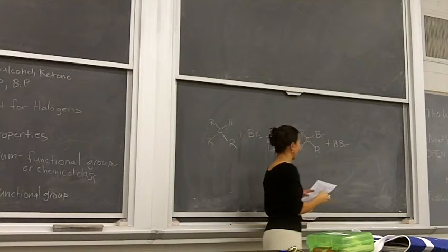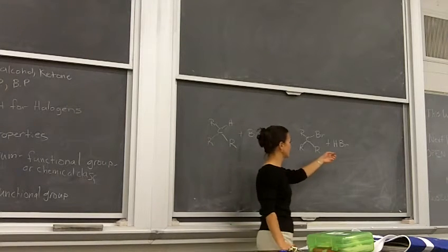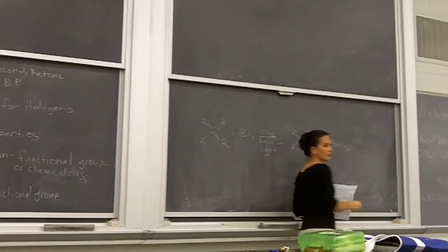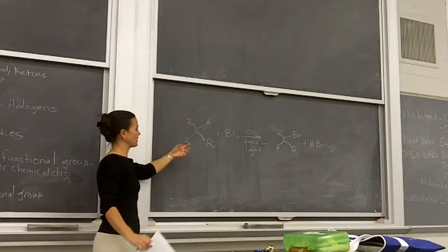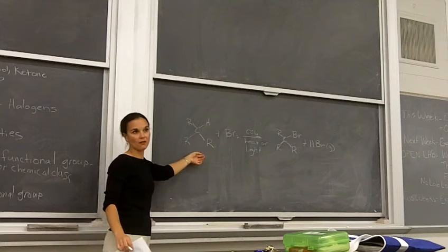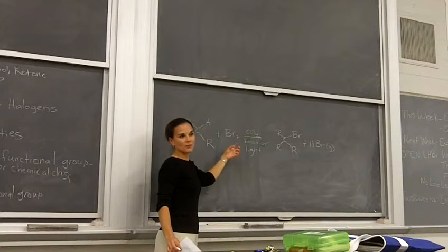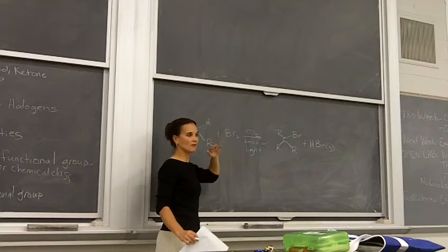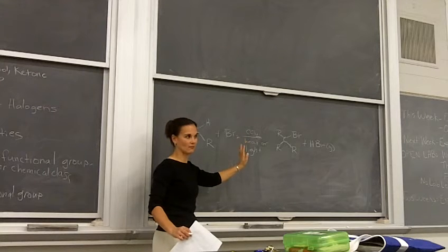The reason that you use pH paper when you do the bromine test is to see if you give off this HBr gas, which will give you red pH paper, okay? Typically, this will turn an orangish color sooner than reacting with an alkene, okay? The thing that gets a little bit tricky is that with the pH paper, you can get false positives. So don't use pH paper as the reason that you are saying that you absolutely have an alkane and not an alkene, okay?